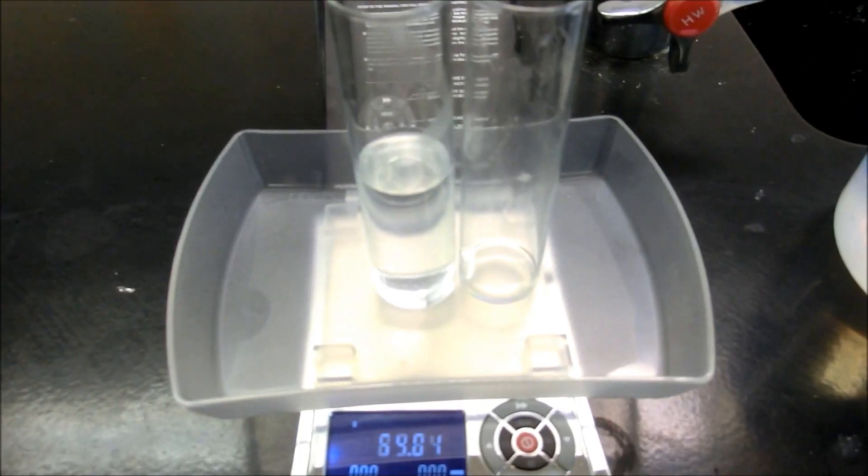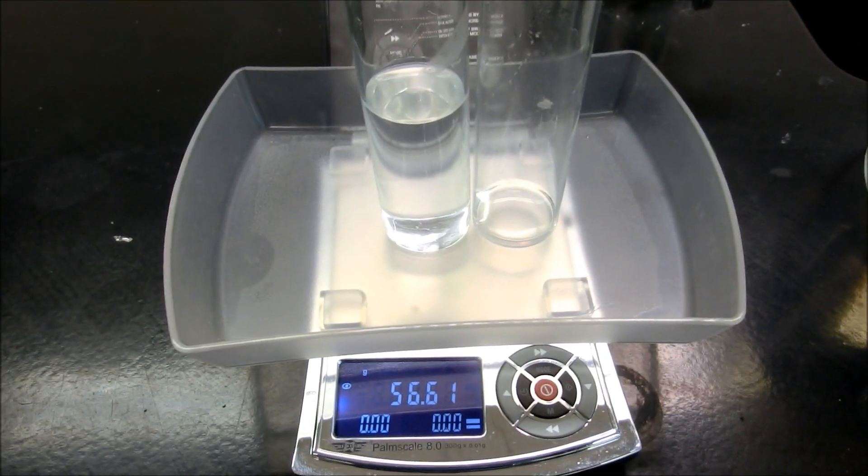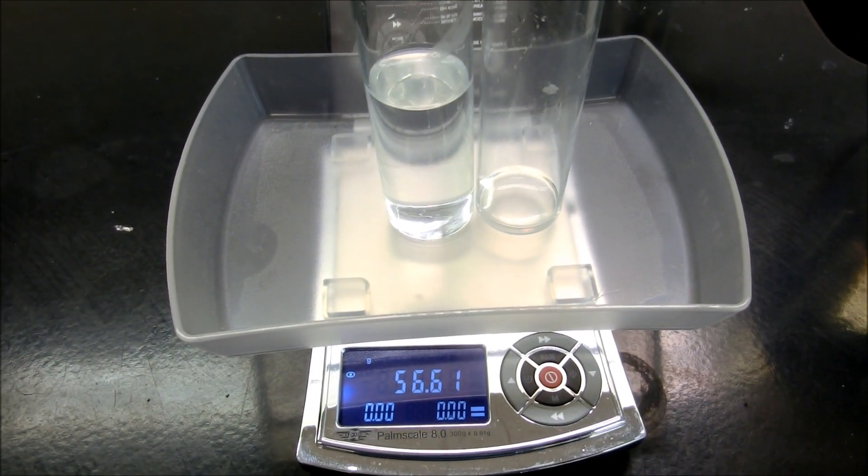The final mass of the sulfuric acid and the sodium hydroxide together ends up being 56.61 grams.